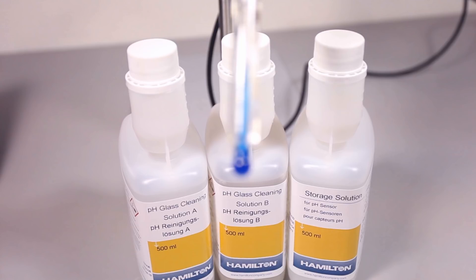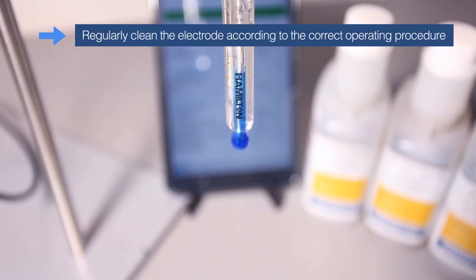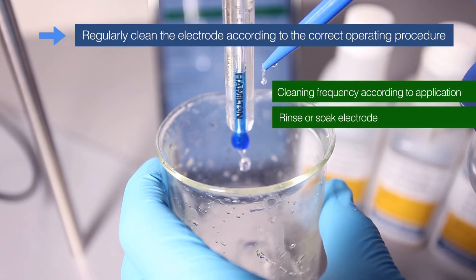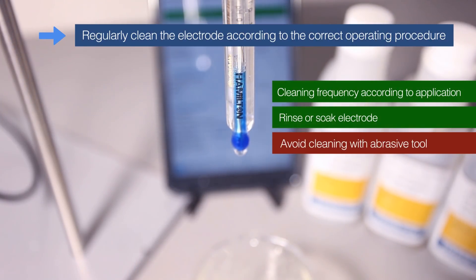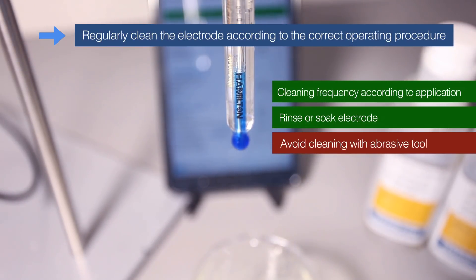Hamilton offers specific liquid cleaning solutions that are developed for pH-sensitive glass membranes. The sensor should be inspected and cleaned on a set schedule. In regards to a correct operating procedure, the cleaning frequency may vary depending on the specific application. Initial cleaning should involve just rinsing or soaking the sensor. Avoid cleaning the glass with any type of abrasive tool, and avoid rubbing or wiping the sensor with a dry cloth as this could create static electricity.